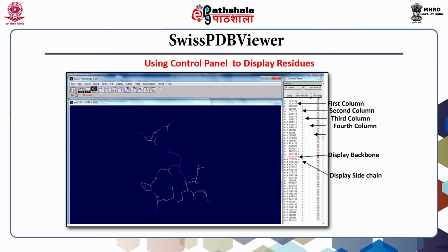Click on small v, this will erase it and simultaneously hide GLU127 in the display window. To display it back, click next to label GLU127 to mark with lowercase character v. 3 residues above GLU127 and 2 residues below GLU127 are also marked with small v in first column to convey that backbones of these residues are also to be displayed. But labels of these residues in the first column are shown in black.